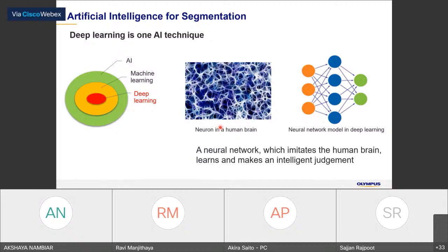For artificial intelligence segmentation, deep learning is one of the hot topics in the market for the biological analysis field as well. For AI, there are actually some levels of image detection. One is called deep learning, which can simulate the neurons in our brain and do complex detection.